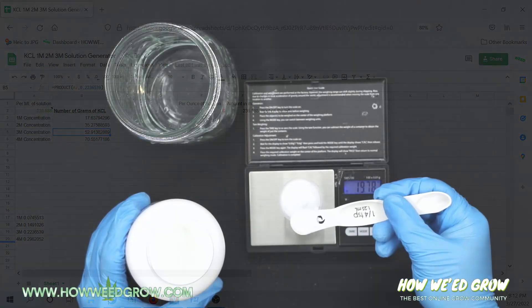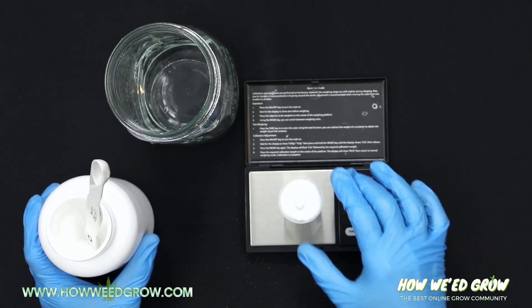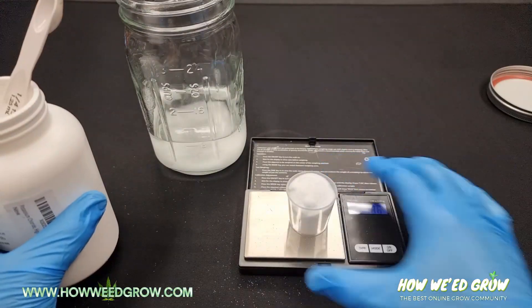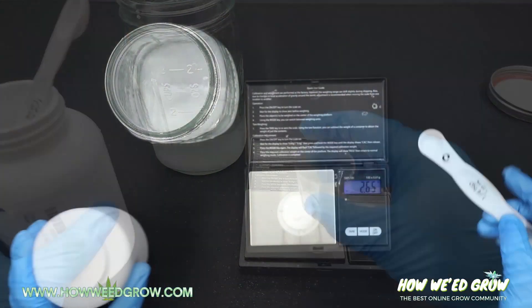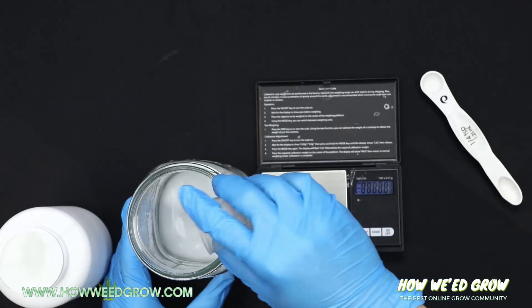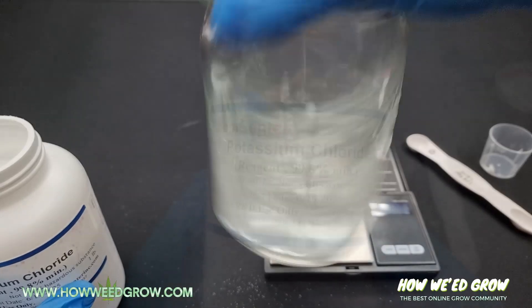Now I'll just have to measure this amount using a digital scale and mix it in with 8 ounces of reverse osmosis water. Just mix it in until it completely dissolves, and that's all!